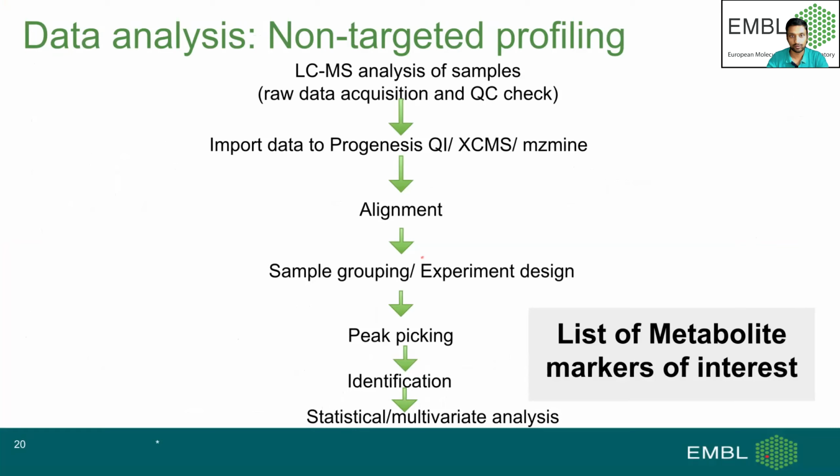So this is overall how you get those features from the software. Once you detect the features, the software aligns your multiple samples or multiple chromatograms, so that in case you have any retention time drift or any mass drift, they will get well aligned. And then comes the identification part. You run those features, the MS and MS/MS spectra, against a spectral library so that you will have the identifications of metabolites.